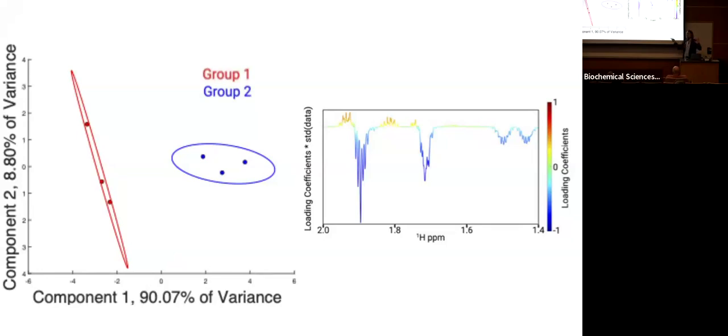Chemometrics essentially uses statistical methods. Before we start to analyze the spectrum and figure out what's what, we'd use statistical methods that will then tell us, through a PCA scores plot or more complicated multivariate analysis and various loadings plots or other kinds of analysis, what compounds are associated with what groups. And so that comes out pretty nicely with chemometric analysis.